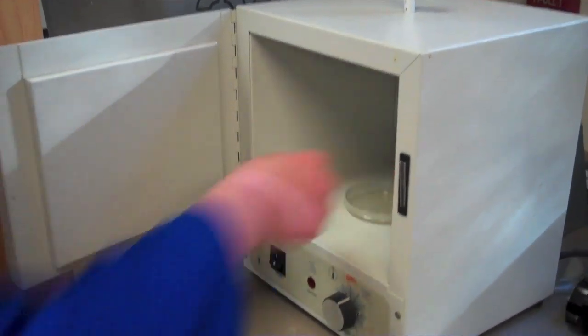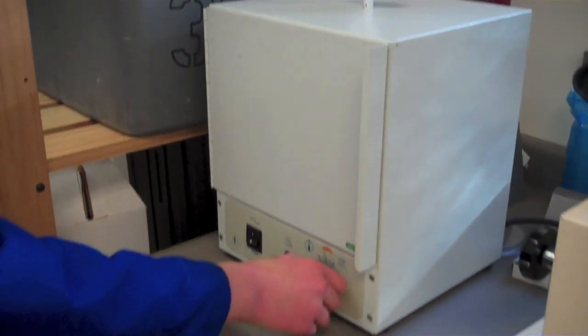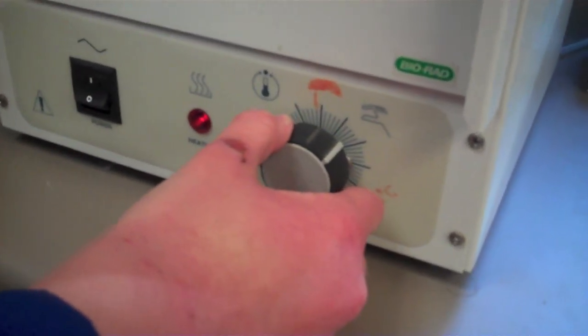Place the petri dish into the incubator for 24 hours. Set the temperature for 35 degrees centigrade.